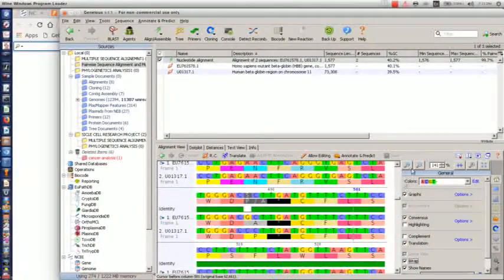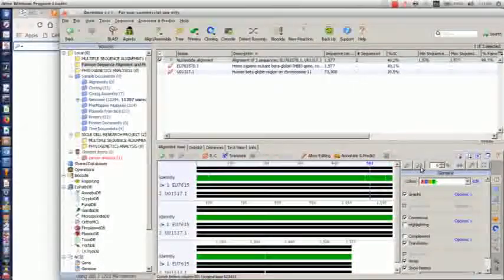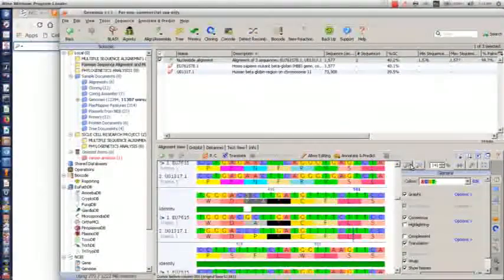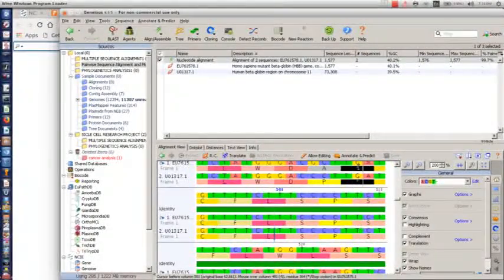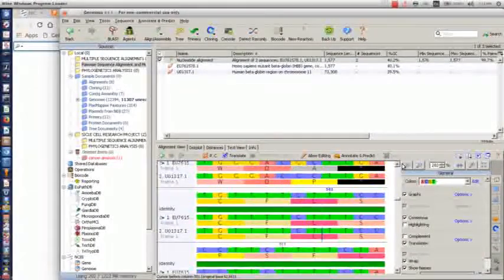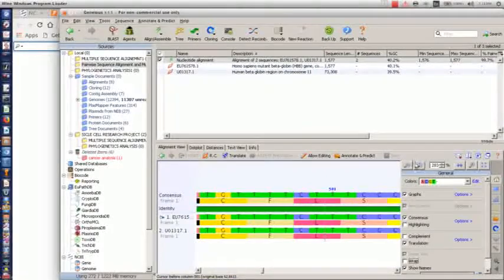If you unwrap, you find a whole lot of dark spots, and in the dark spots we have something like a star. Are you getting it now? Star here. So they all signify a stop codon. So let's just try to unwrap.